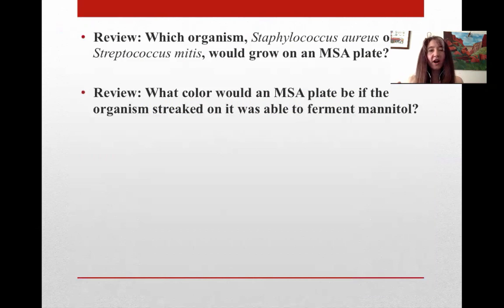So regarding the staphs, we need to change our attention away from the streps and towards the staphs, but let's use a natural segue. So say that you think you do have strep throat. You saw a bunch of beta hemolysis on the plate. You see the really clear zones at the bottom of the stab mark, in which case you might think, gosh, I should gargle with some salt water, right? Because salt is very suppressive against the streps, but it allows the staphs to grow.